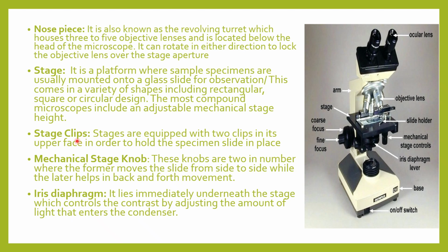And then next is stage clips. So yes, these are the stage clips here, as you can find there and here. After placing the slide, you can clip it so that the slide does not move, and so you can observe the specimen properly.